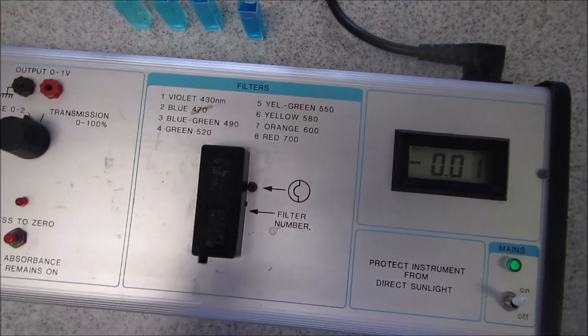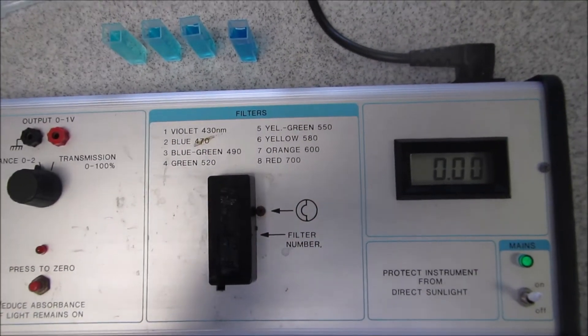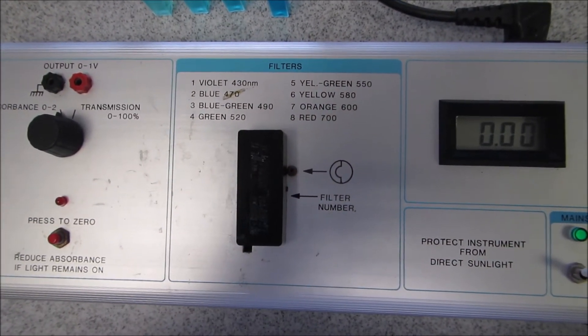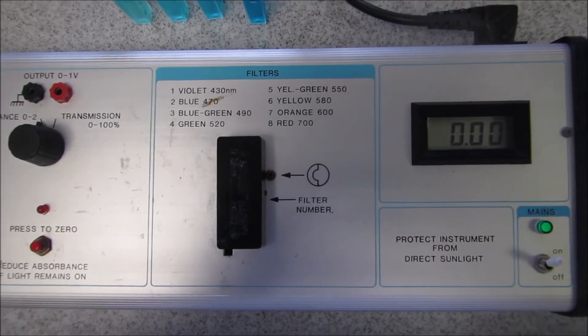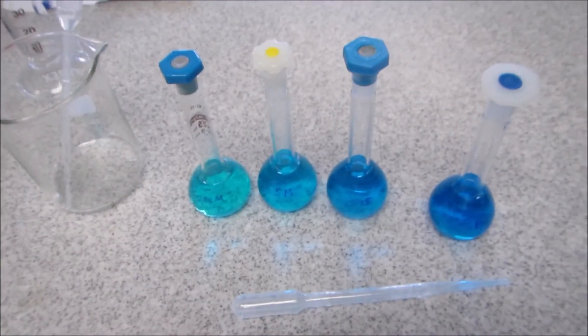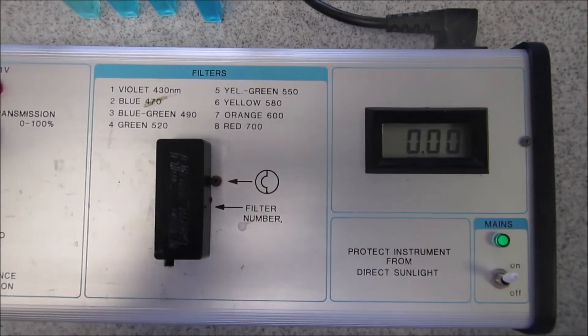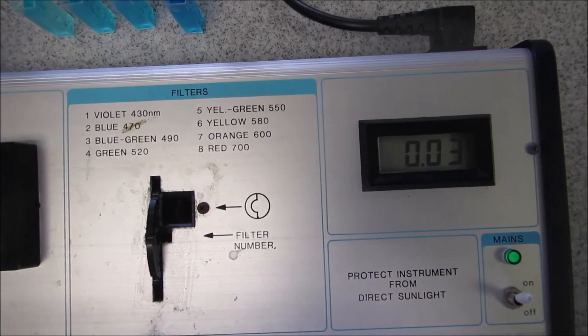I'm just going to put back in my blank and check it's still at zero. That is the first part where you've worked out where the maximum absorbance is. The next part you have to do is work out what the absorbance is for all the different concentrations and use this to produce what's called a standard curve. From the standard curve you can then use it to estimate the concentration of copper in an unknown.